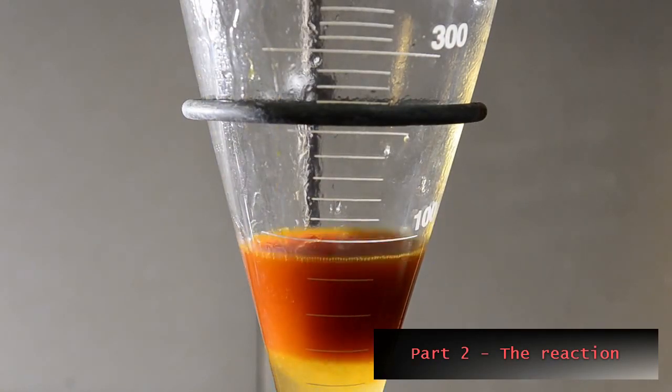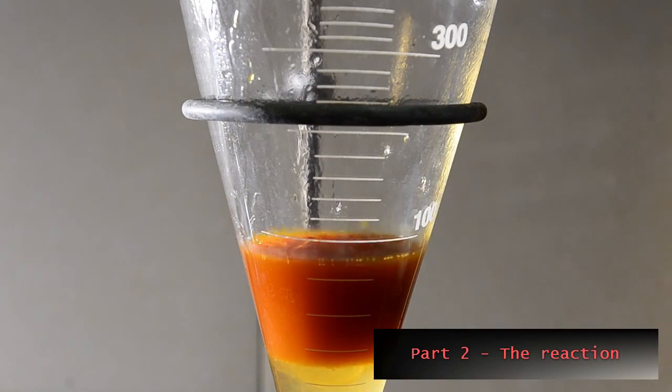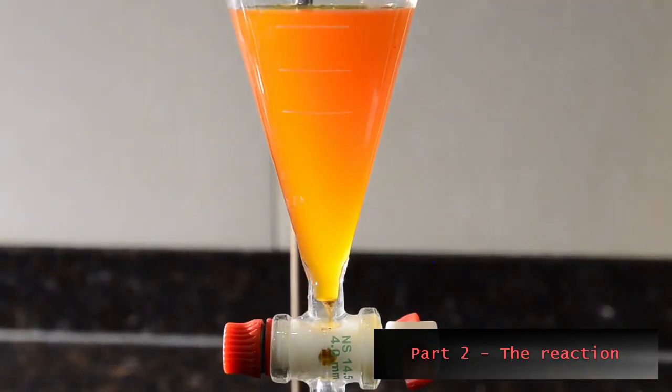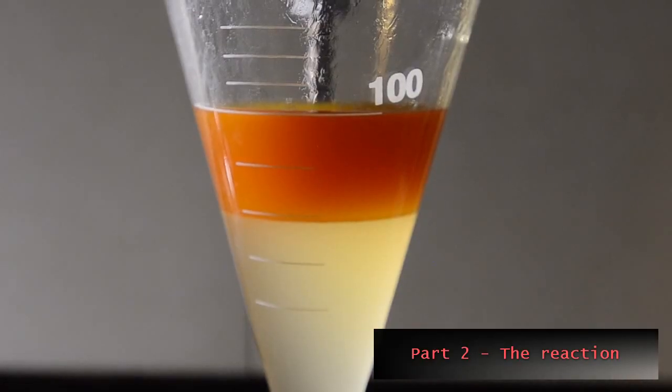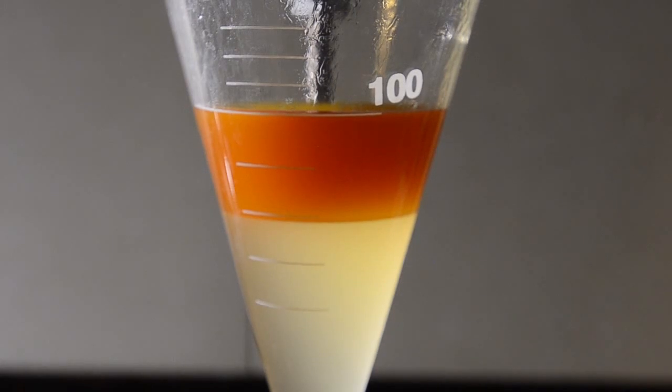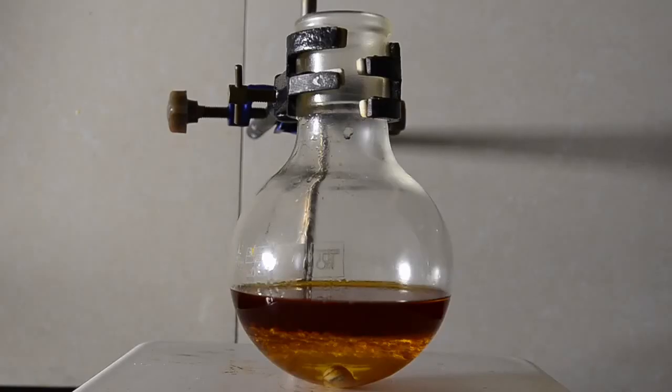Combine the product and toluene layers in the funnel and wash with 10 milliliters of saturated sodium bisulfite solution. This will remove any unreacted benzaldehyde. Finally, wash the product and toluene mixture with 50 milliliters of saturated sodium chloride solution. Reserve the orange top layer and place into a 250 milliliter round bottomed flask.